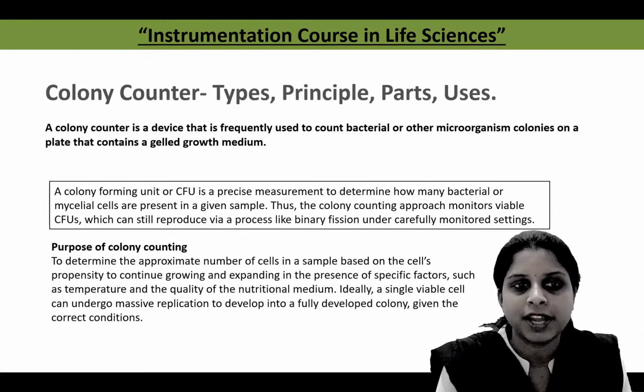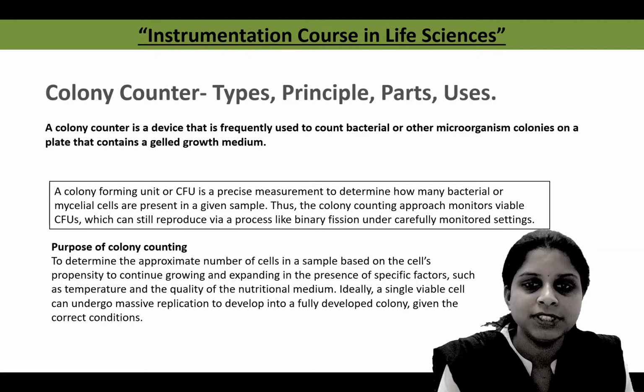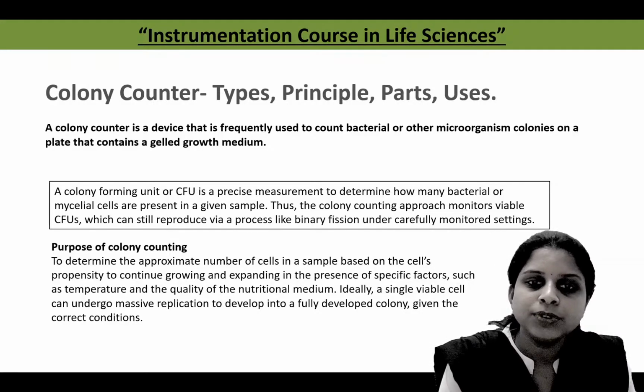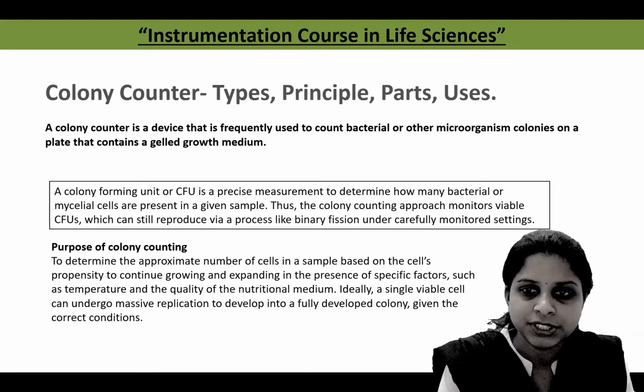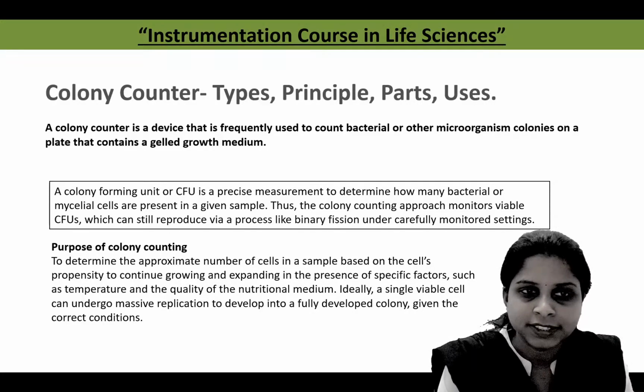A colony forming unit, or CFU, is a precise measurement to determine how many bacterial or mycelial cells are present in a given sample. Thus, the colony counting approach monitors the viable colony forming units which can still reproduce via a process like binary fission under carefully monitored conditions.